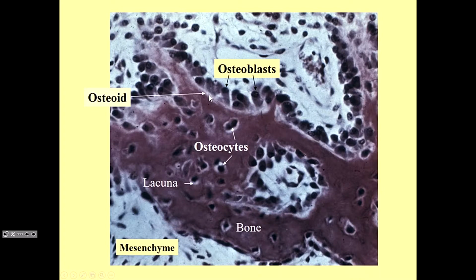So the osteoid always stands as a lighter area because it's got more organic material like the type 1 collagen, GAGs, and proteoglycans, and has not yet been fully mineralized. Once that osteoid becomes mineralized, it stains a darker color, and then it can trap our osteocytes residing in our lacunae. Okay, so that's what bone looks like.